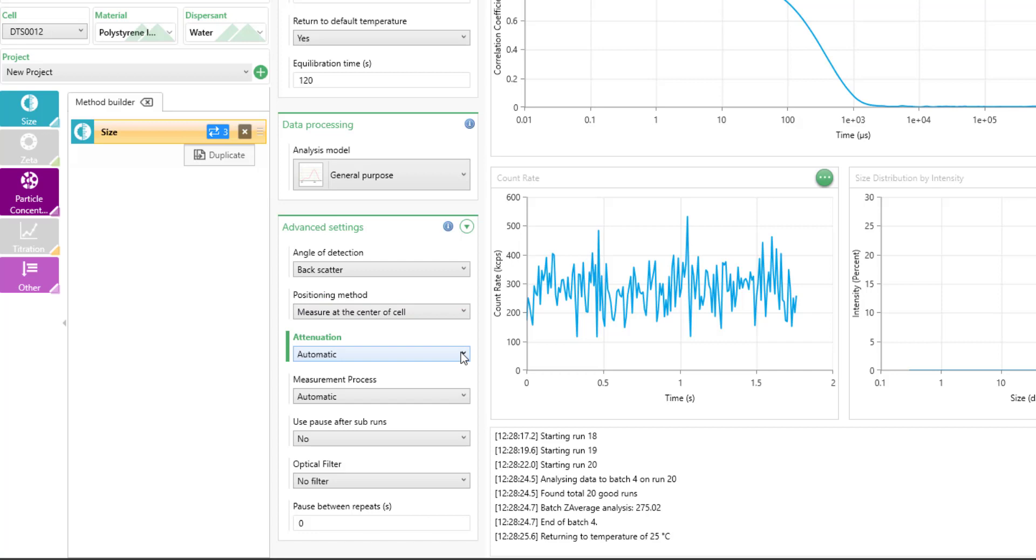For the attenuation, this is a laser attenuation. So we have a filter that we are changing the power of the laser that we're using for your measurement to optimize the count rate for our detector for the highest sensitivity of measurement. We highly recommend using only automatic here and not using manual. This is to prevent damage to your detector by accidentally overwhelming the detector during the measurement by using a manual setting.